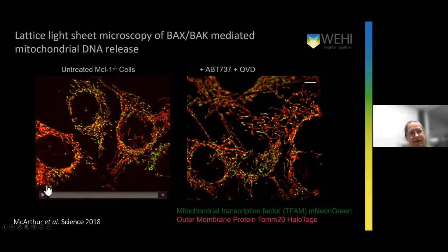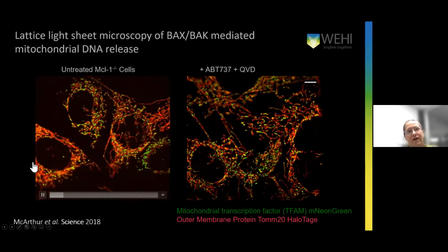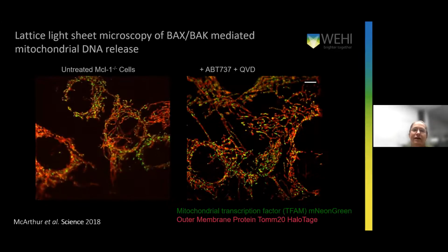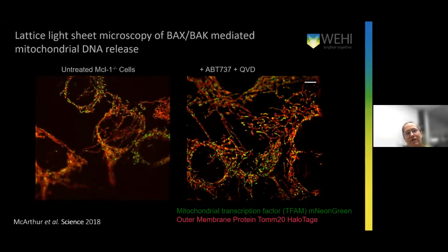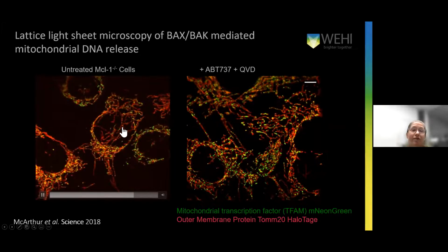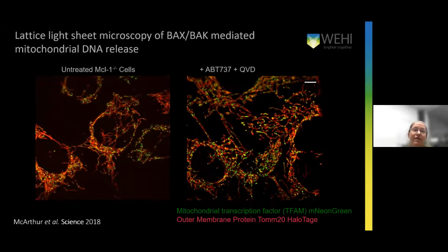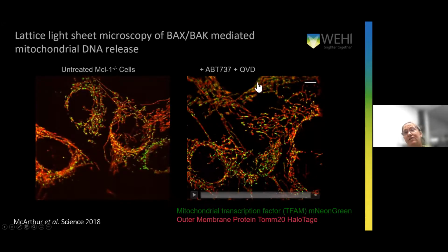So then we went back to Janelia after Kate had generated these new cell lines, and now you see these new cell lines are instead using mNeonGreen, which is a much brighter fluorescent protein and much more photostable. And also the HaloTag, sorry, that's spelled incorrectly there, but the HaloTag and all of these dyes from Luke Lavis, who's at Janelia, which are very photostable and very bright. So these are in control cells. You can image for up to 2 hours on the lattice, continuously acquiring volumes as you go, and the cells can withstand it. And then in this case here, we add in this drug, which induces apoptosis.